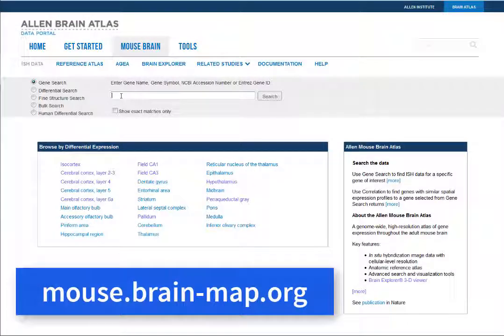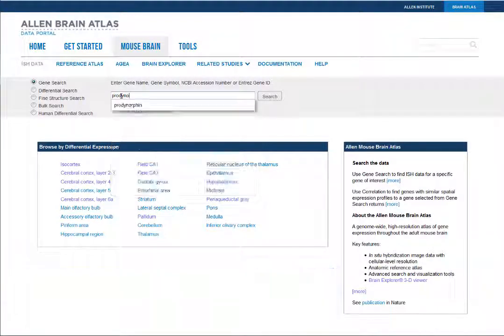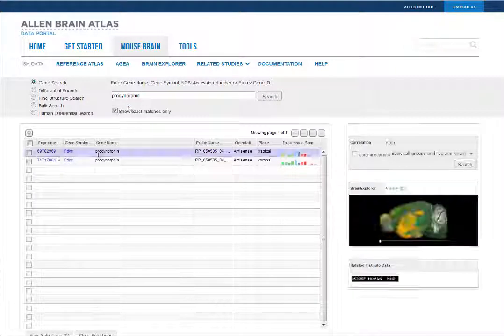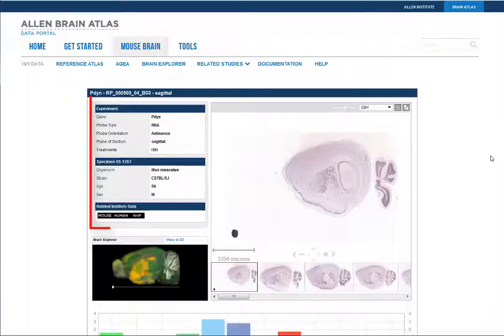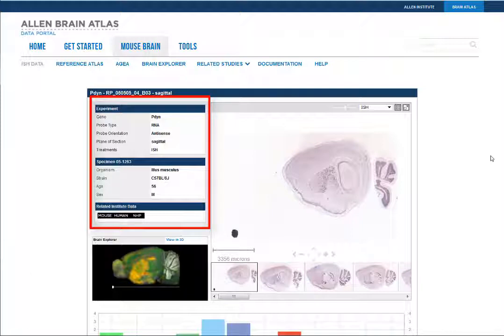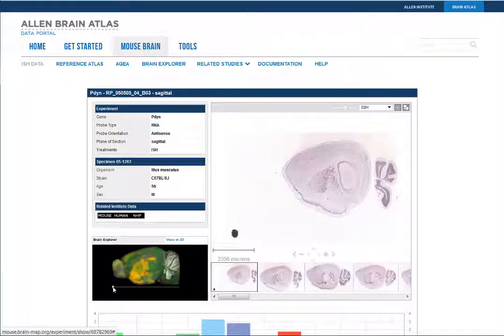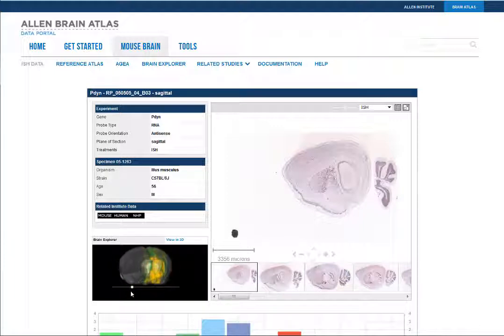From the Mouse Brain Atlas, performing a search will return a list of genes meeting the criteria of your search. Selecting the experiment ID will take you to the gene page where you'll see the metadata for the experiment, a three-dimensional preview of the gene expression, and the main image viewer.